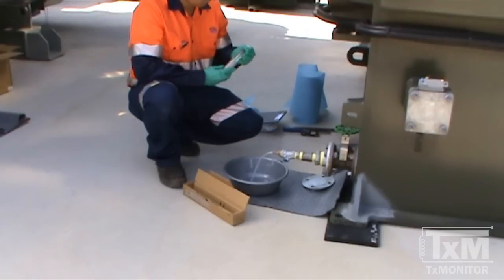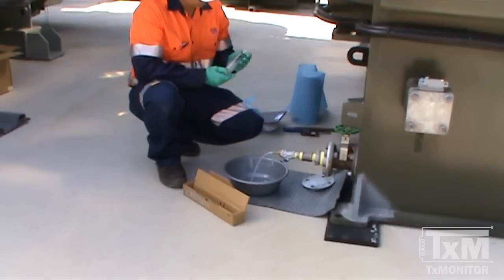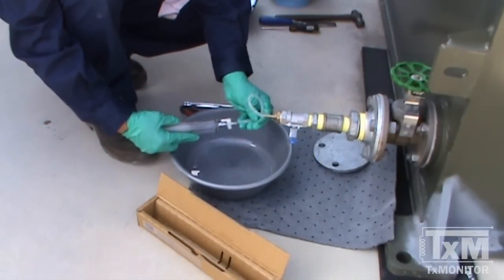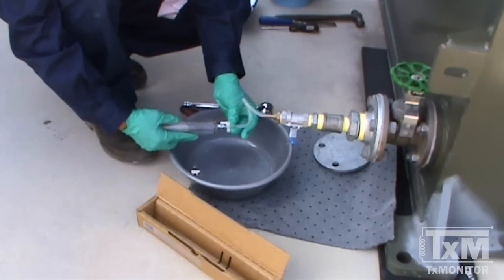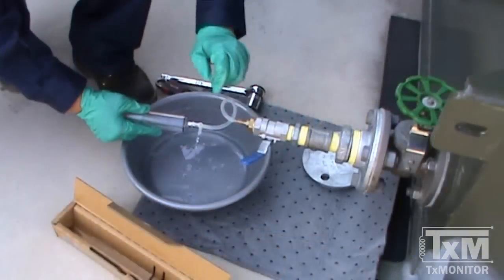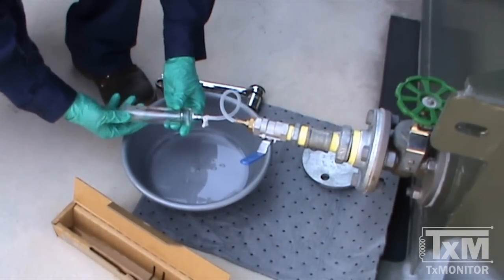Ensure the stopcock is attached to the syringe and that it is free from debris and obstructions. Attach the silicon tubing to the stopcock. Open the sampling valve to a gentle flow, then open the stopcock to position two and allow the liquid's pressure to push the plunger back.